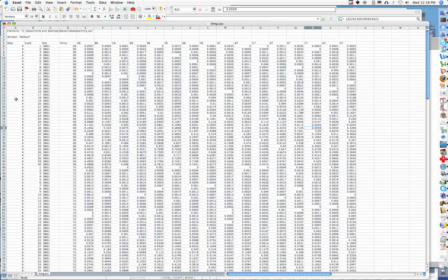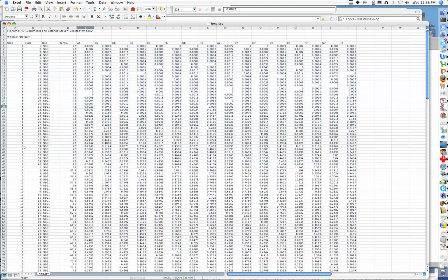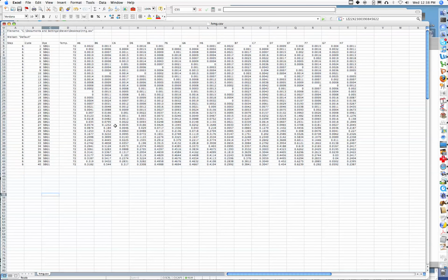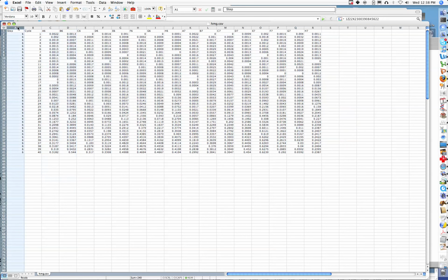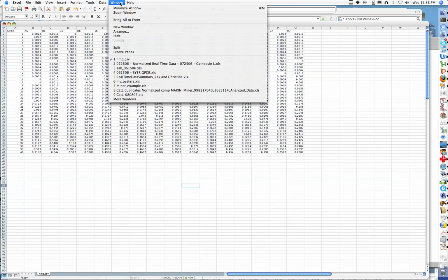So the first thing we do is we'll just simply trim up the file with all we need. We don't need to do two. You could take the average, but I'm going to just use the fluorescence data for the extension step. So that's roughly the correct format.